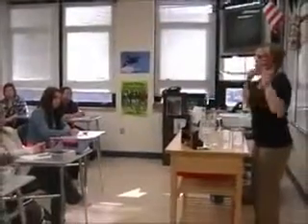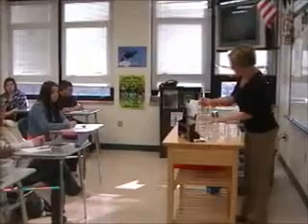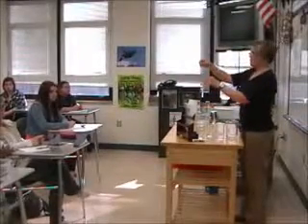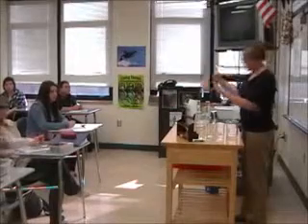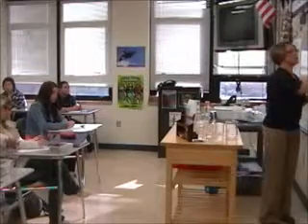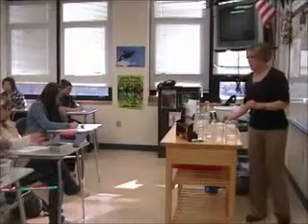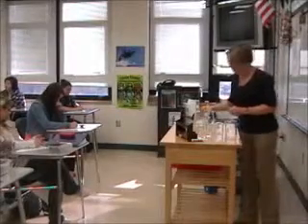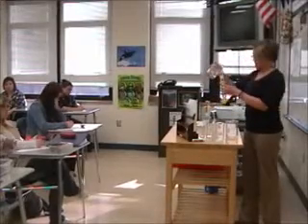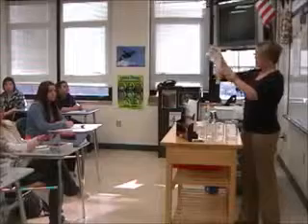Something about the solution. This time we're going to use a warm solution. I let this solution get awfully hot. It's actually at about 76 degrees Celsius. So let's put that in. All right, and hopefully I can pick that up. We're going to put in another 20 milliliters of solution A, and this solution A is quite warm.